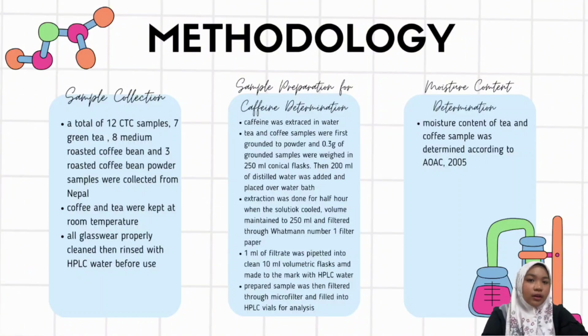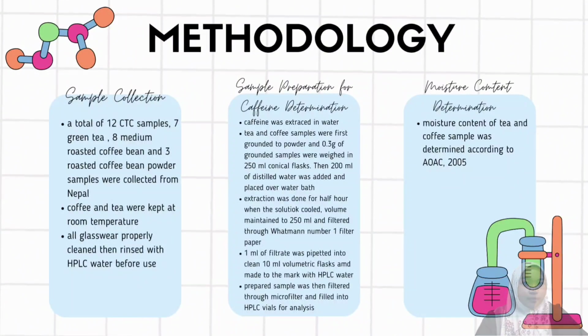Next is moisture content determination. Moisture content of tea and coffee samples was determined according to AOAC 2005.